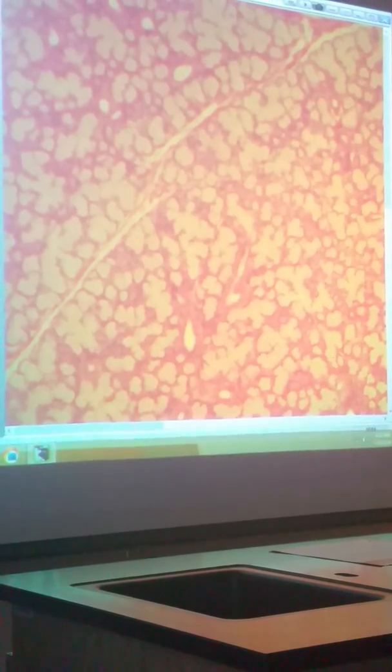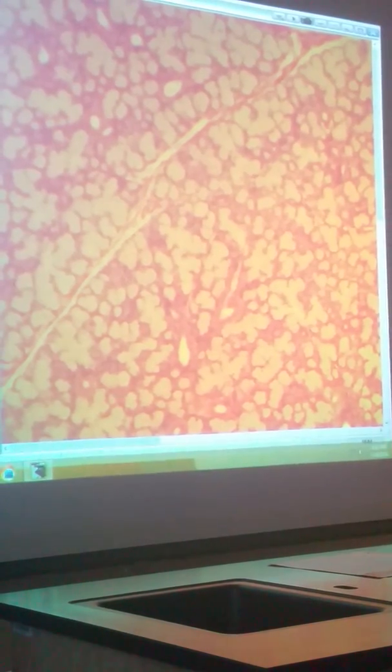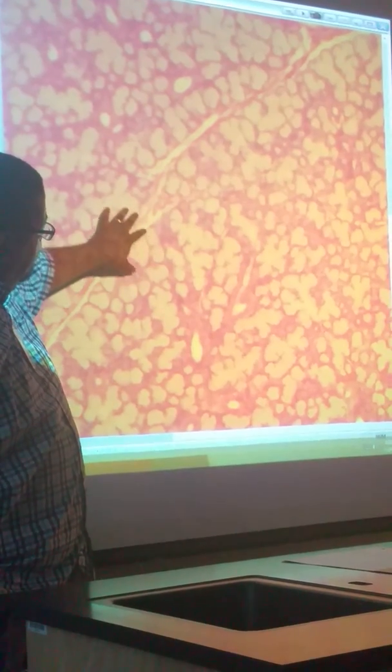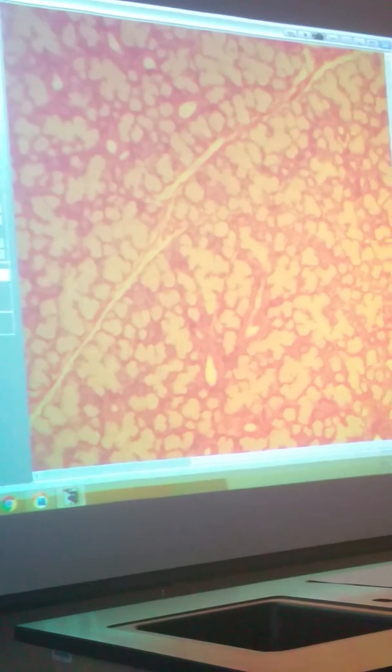I have a question on this. You said that's whitish gray? Because it looks orange. Well, whatever color you see it as, that's the color you study it as. I'm really not trying to be funny. Sure. Whatever color you see it as, but they are like white clouds, grayish clouds. This is how it's showing up under this microscope, okay?